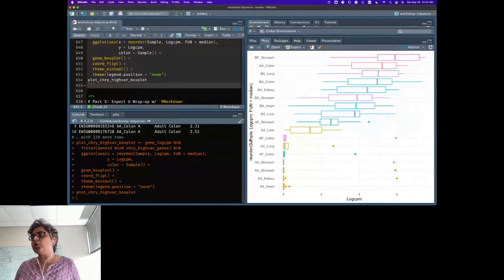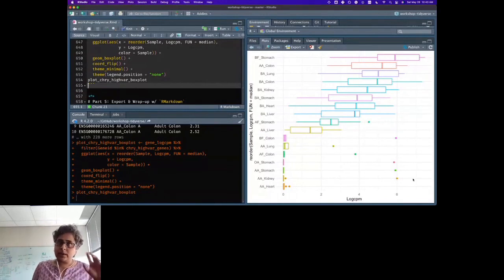So this plot is showing us a much cleaner distribution than what we saw in the first box plot that we made with all of the data. So you have your samples and you have this. Now, based on the chromosome Y genes, what do you think this tells us about the lower half of the sample or lower third of the samples versus these other ones? Anyone?